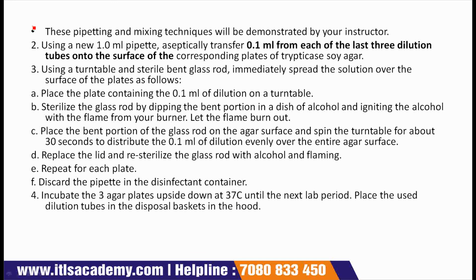So we have taken our 1 ml of sample. Now next one is, these pipetting and mixing techniques will be demonstrated by your instructor.